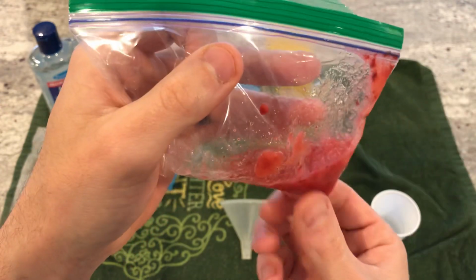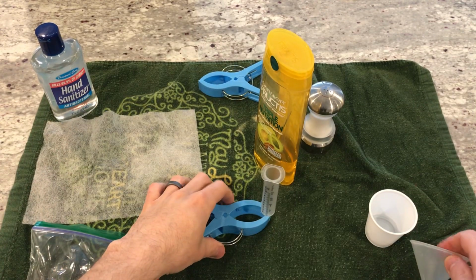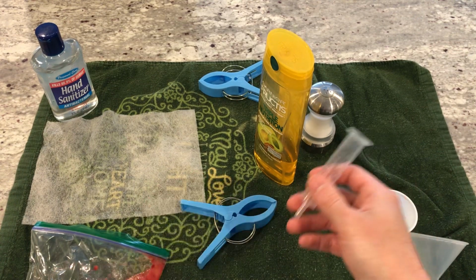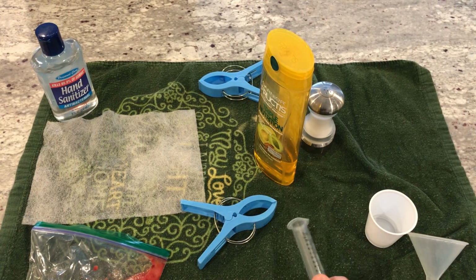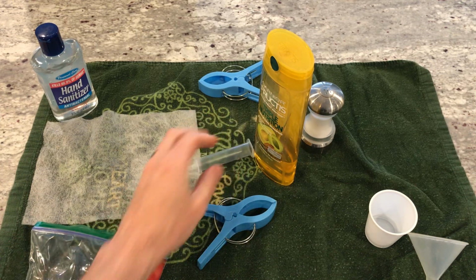Okay? Now, we're going to take this whole setup and we're going to put it through our little quote-unquote test tube apparatus, which actually I really needed to seal off at the bottom. Give me 1 second.